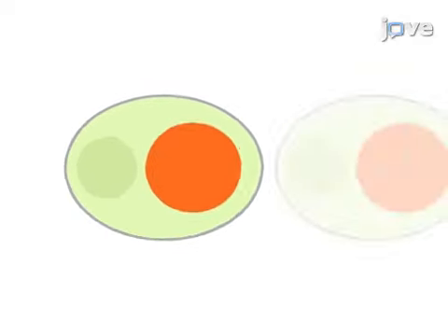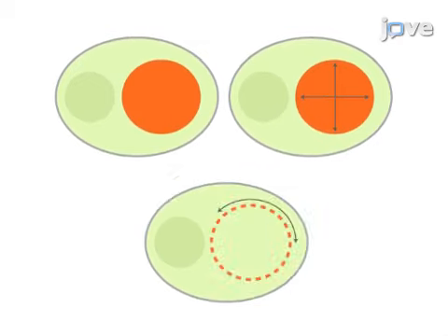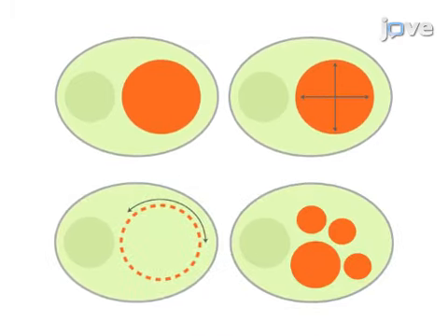Ultimately, live fluorescence microscopy is used to visualize chlamydial inclusions within the host cell and to measure biological parameters of inclusions for quantitative results. The main advantages of this technique over existing methods, like antibody-based enumeration, are that this reverse imaging strategy can be used on live cells and also in collaboration with other fluorescent labels to quantitate inclusion dynamics of all chlamydial species. Furthermore, unlike routine methods that label bacteria and cells, this approach illuminates the inclusion membrane in living cells and can thus reveal important dynamic properties of this pathogen-containing compartment.